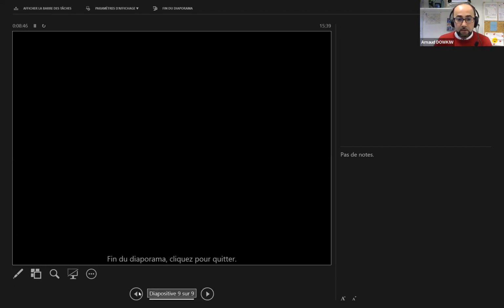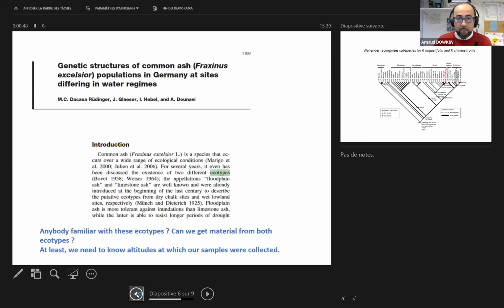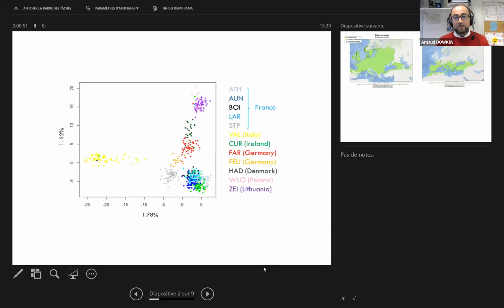Okay, that's all I wanted to say. When we look at the results that we all got from the 4-tree array, we see groupings of populations. I tend to see something that has to do with altitude, sorry, with latitude. I think the more data we can gather, the clearer it will be. Sorry for my English. The discussion is open.